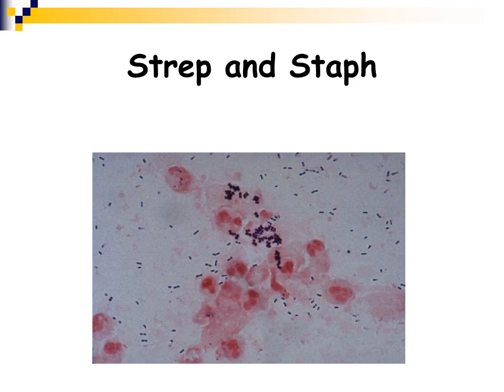So in general, on agar media, Staphylococcus tends to be larger than Streptococcus. Streptococcus is usually very pinpoint, teeny tiny. And also under the microscope, Staphylococcus organisms tend to be a bit larger than the streps. However, that's easy to see when you have staph and strep under the same microscope, but commonly you don't have that, so you wouldn't really be able to tell just by looking under a microscope if you had staph or strep. You have to go on and do that catalase test.